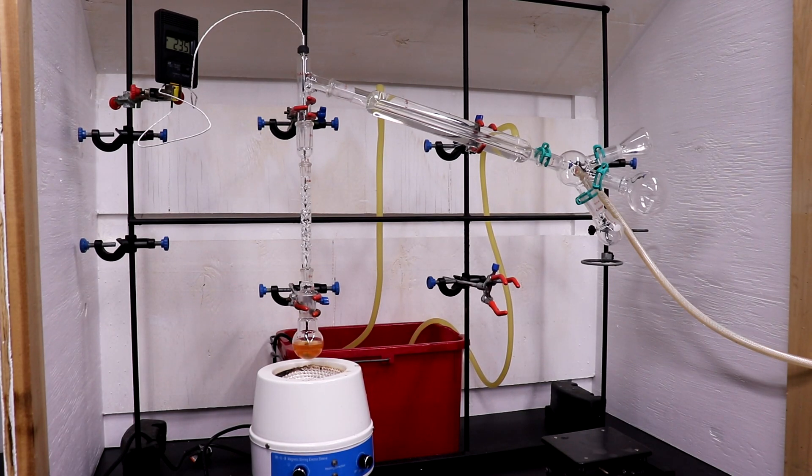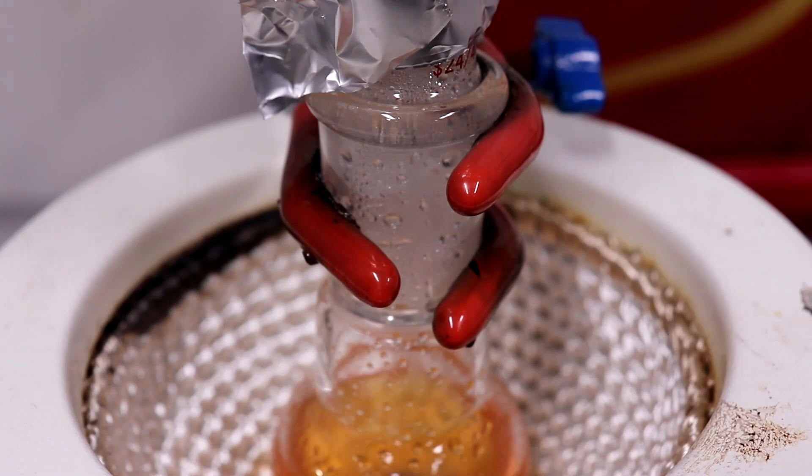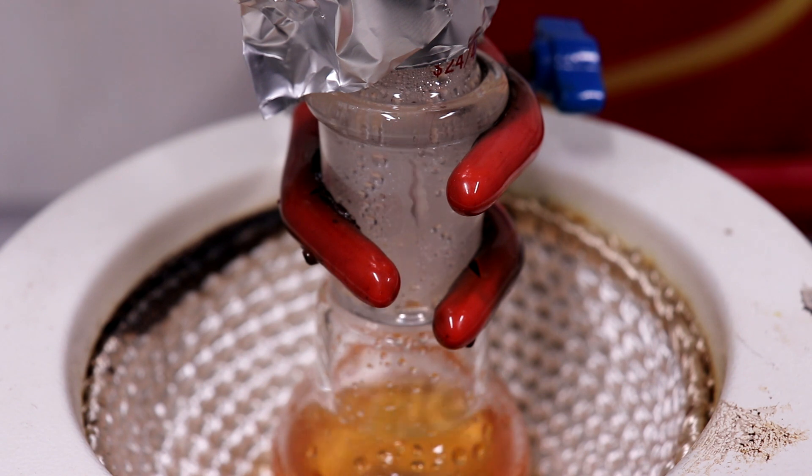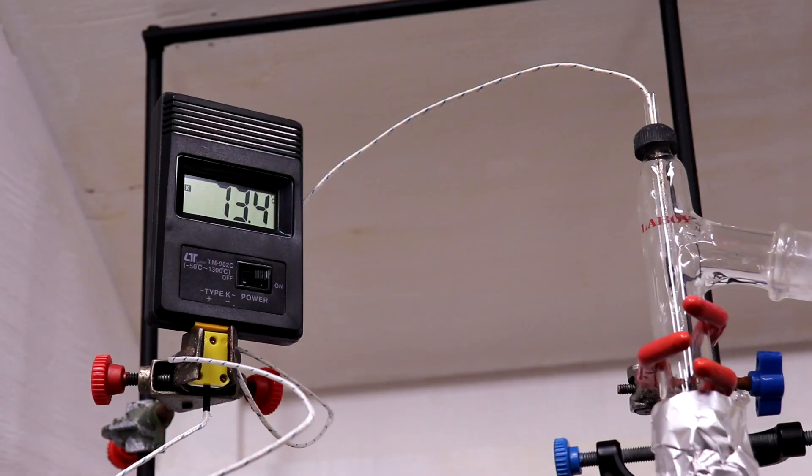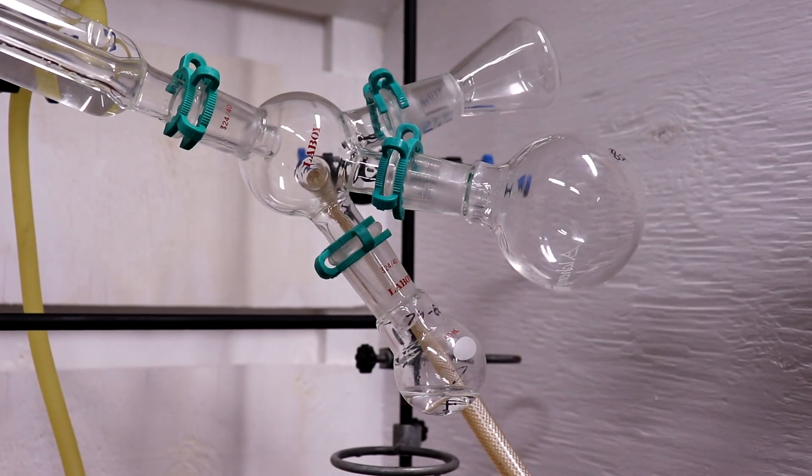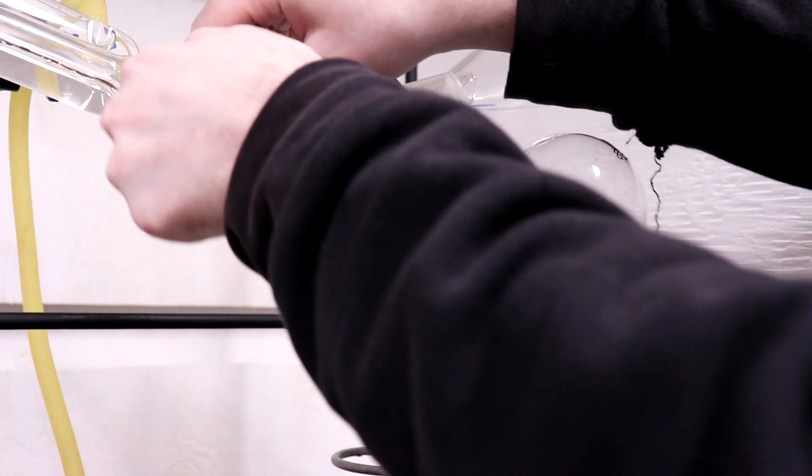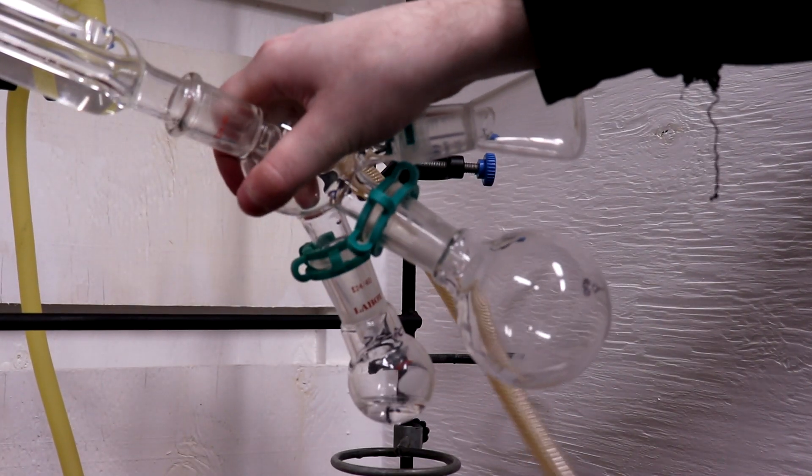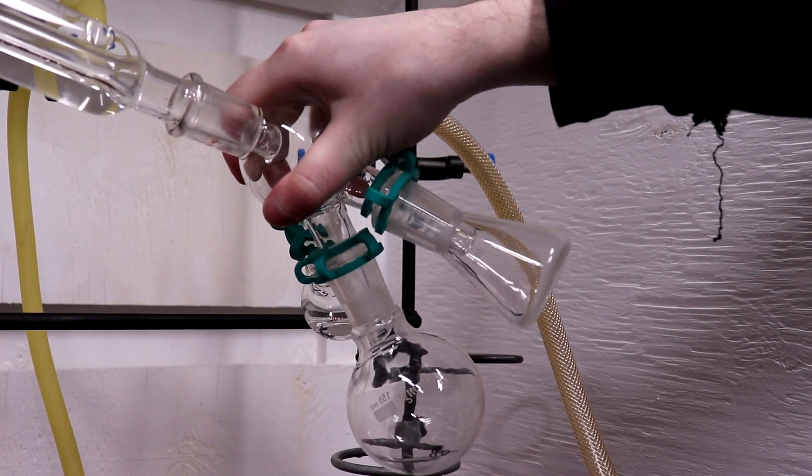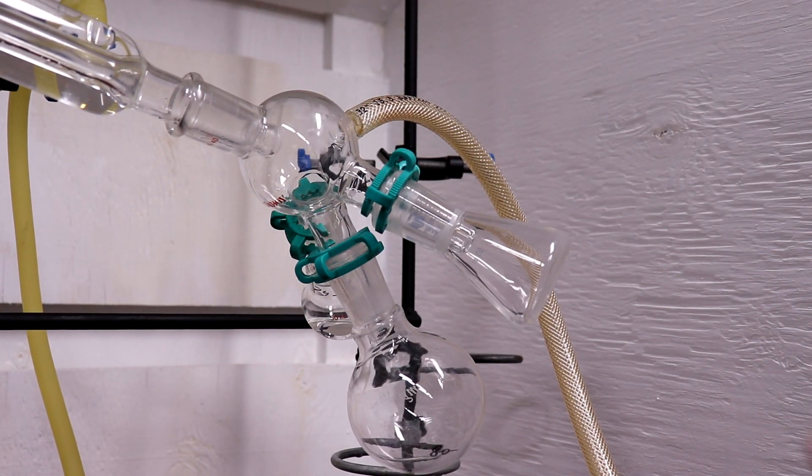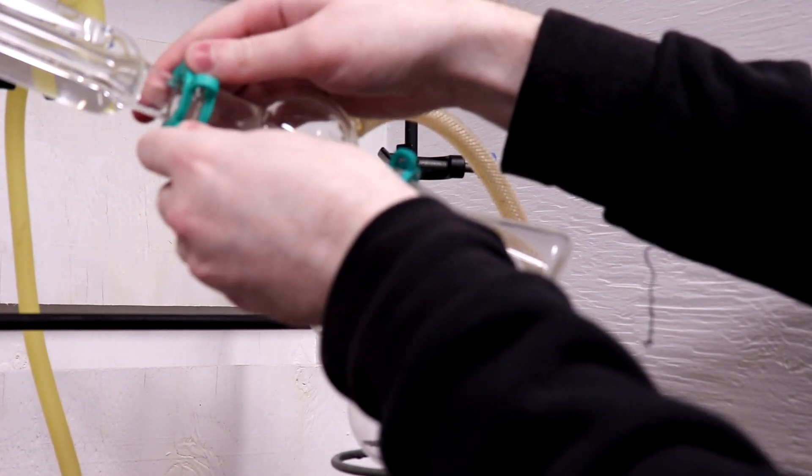I then set up for a fractional vacuum distillation to distill over our product. Despite having a fractional column, no clean fractions were observed. The temperature just very slowly increased as the distillate came over, and it went from a range of 74 to 84 degrees Celsius.